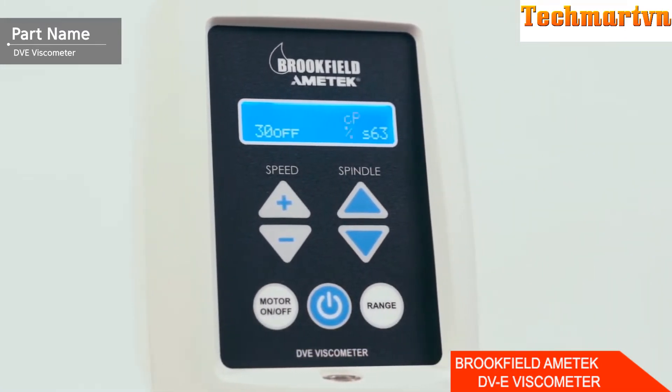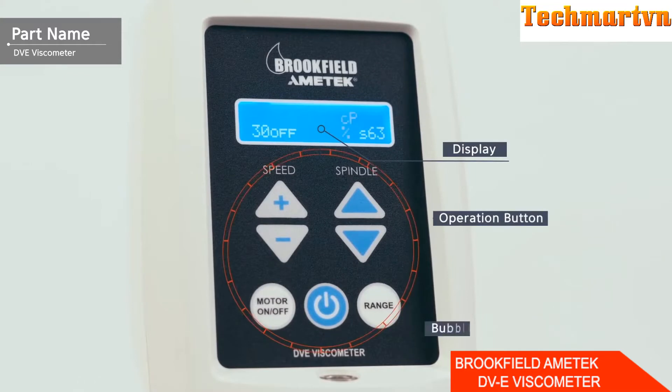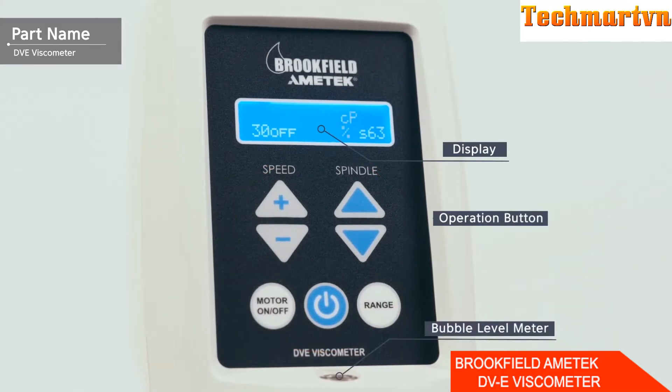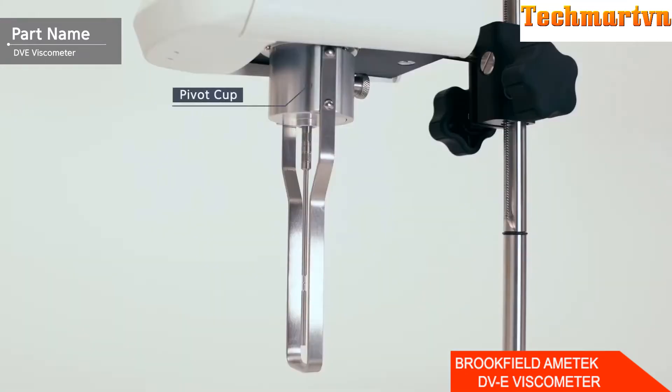On the front of the main body, there is a display, various operation buttons, and a bubble level. There is a power adapter connection port on the rear. At the bottom of the main body, there is a pivot cup and coupling screw.